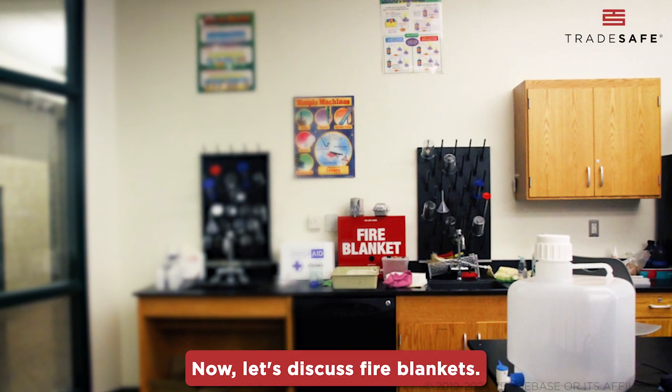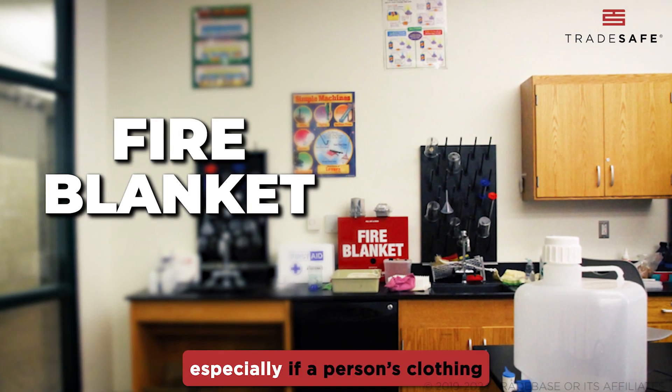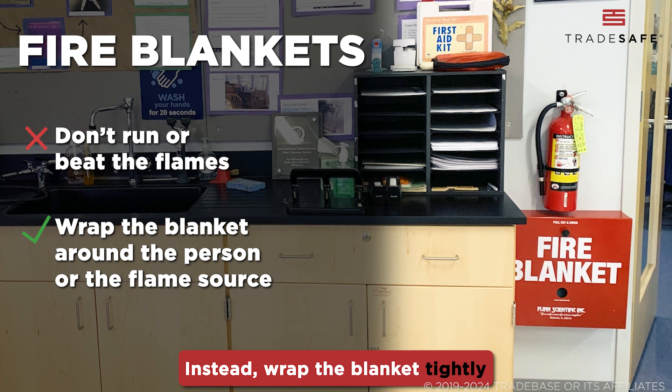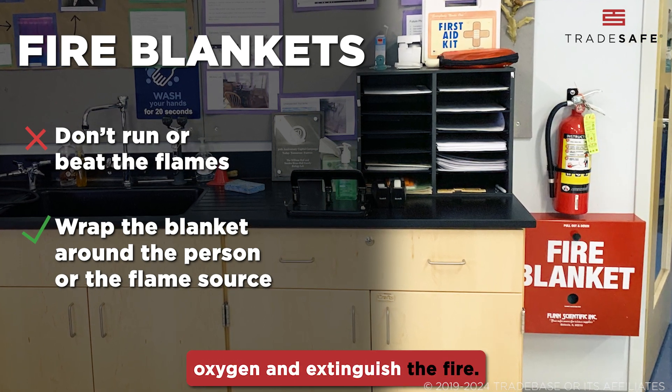Now let's discuss fire blankets. Fire blankets are great for smothering flames, especially if a person's clothing catches fire. Don't try to run or beat the flames. Instead, wrap the blanket tightly around the person or the flame source to cut off oxygen and extinguish the fire.